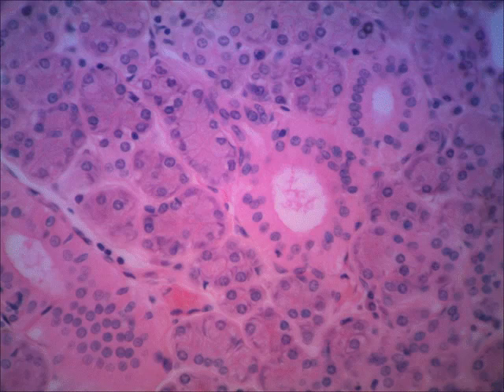Now, if we move on to the next view, it takes a minute for these to load. I apologize for that. Eventually, it will get there. Here we go. Now you can see it on high power. And the ducts are much more obvious here. So there you see a duct. Here you see another duct. And then you see several secretory clusters.